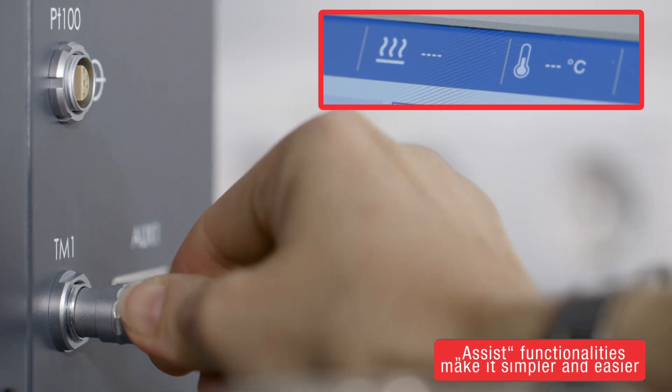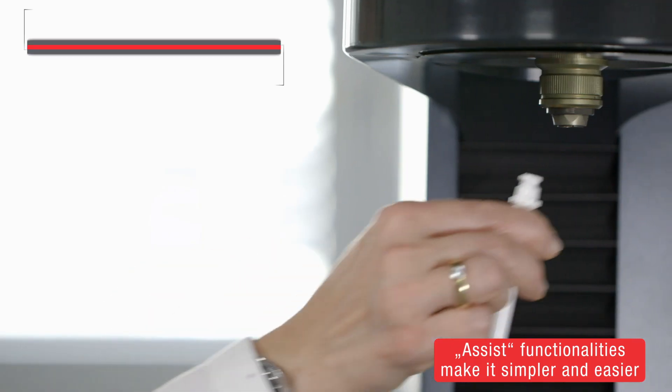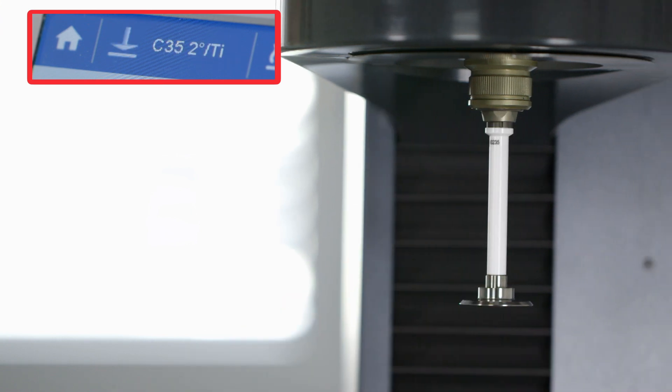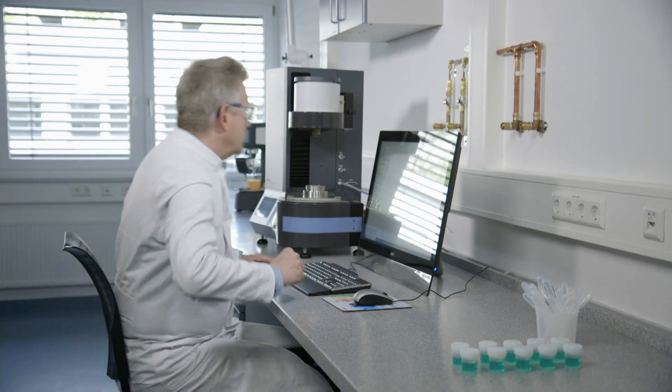Assist functionalities simplify operations and help users avoid mistakes. See for yourself how easy rheology can be.